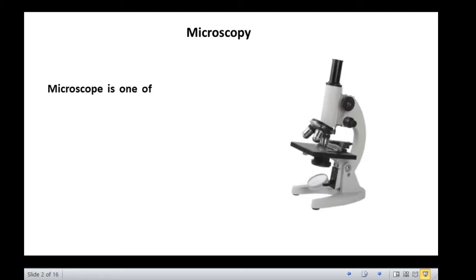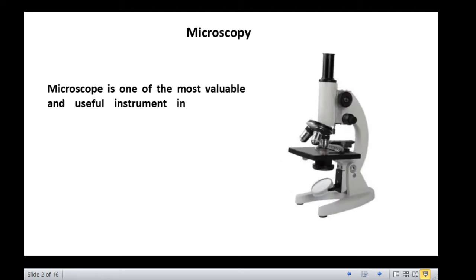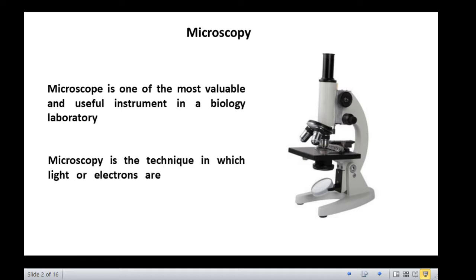The microscope is one of the most valuable and useful instruments in a biology laboratory, and microscopy is the technique in which light or electrons are used to obtain magnified images of minute organisms. We will first start our discussion today with the history of microscopy.